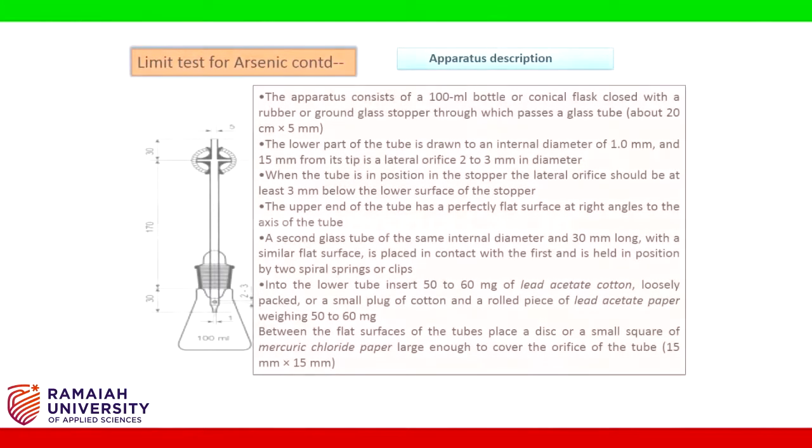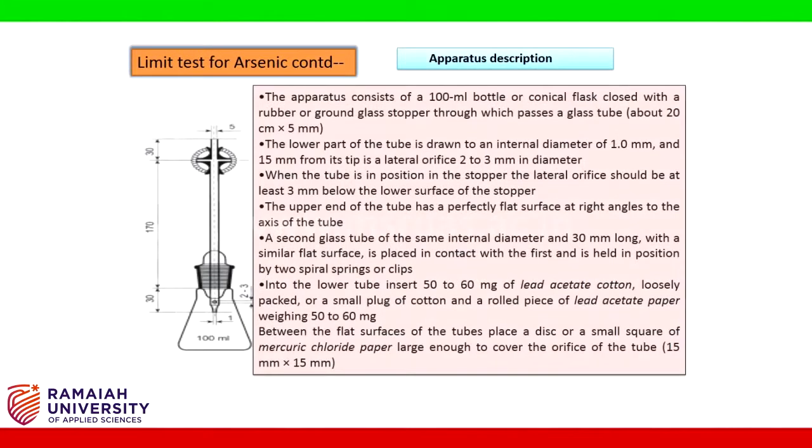To carry out this limit test, we use a special type of apparatus which is designed by Gutzeit, and the name of the apparatus is the Gutzeit apparatus. The slide gives the description of this apparatus.